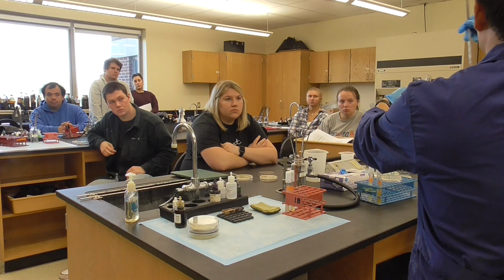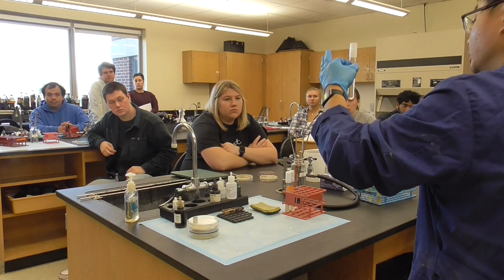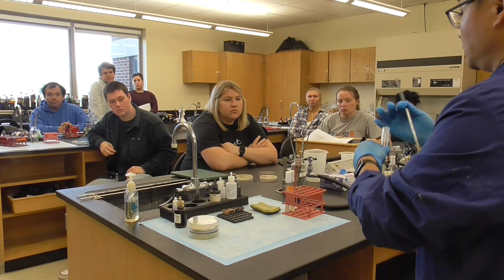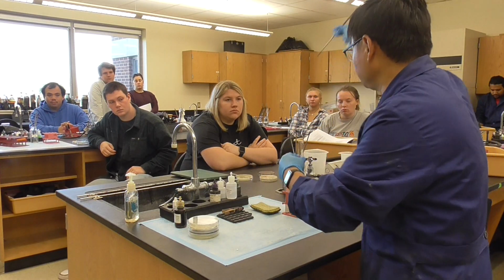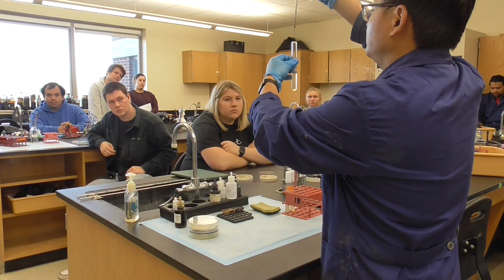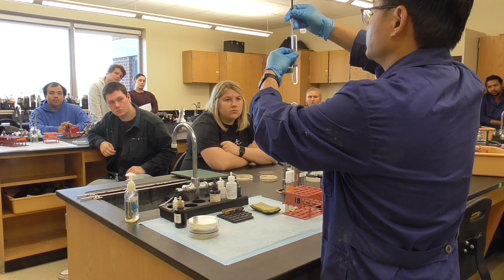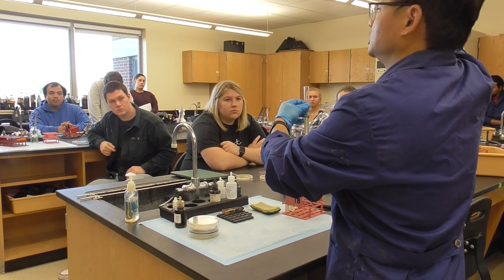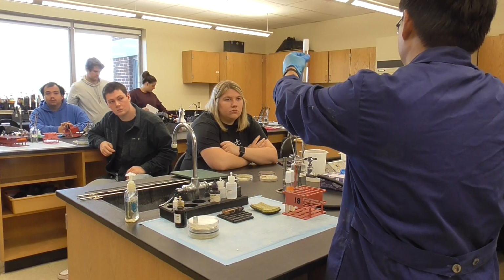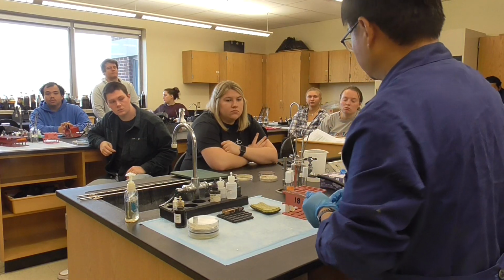You don't have to do that. Because we want to clearly see the motility happen. If you damage it, you're not going to see anything. So, very gentle. Flame, add it, touch the bacteria, very gentle. One more time. Very gentle right in the middle. Took it out. Because it's a semi-solid agar. It's not solid. If you do this, it's broken. Okay? That's the first one.